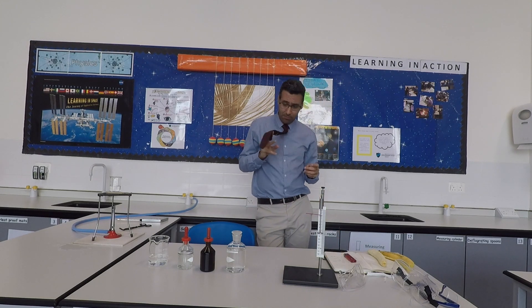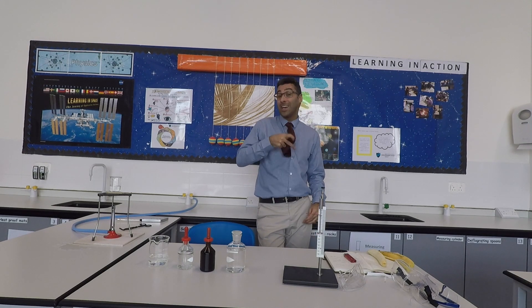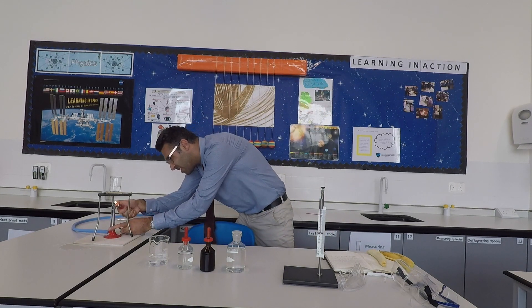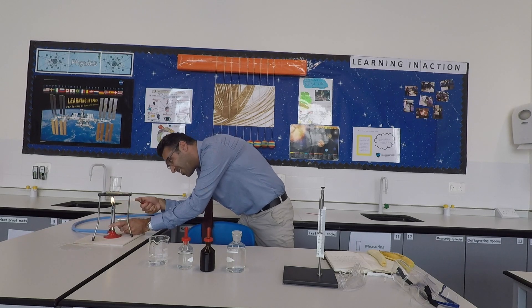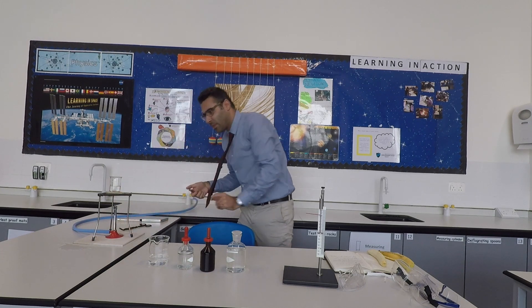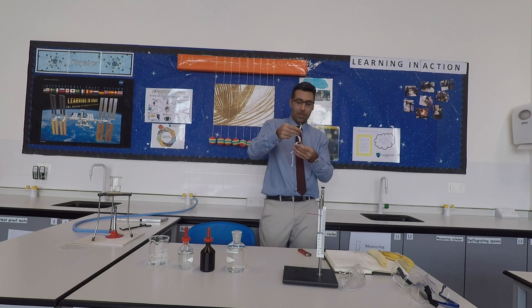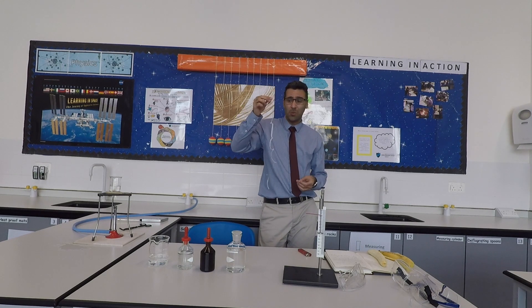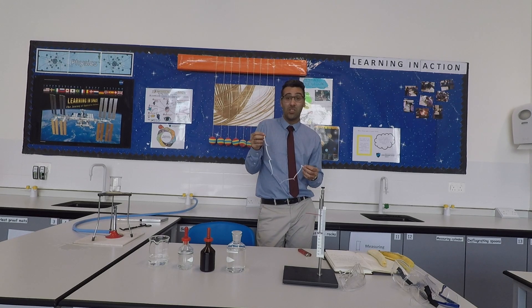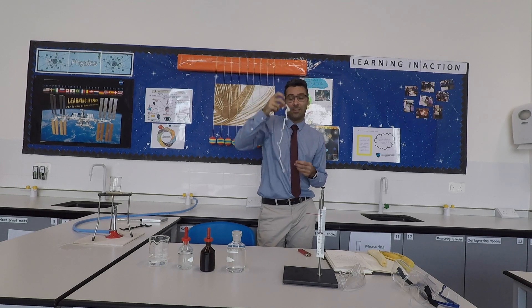If you wear long ties as part of your uniform, tuck it inside your shirt, like this. If you have long hair, put it back. I don't have long hair, so I'm going to demonstrate with this paper. You don't need to do this — if you are a smart kid, don't do it at home. If you are not so smart, stop watching right now, because I'm about to demonstrate burning hair using this paper.